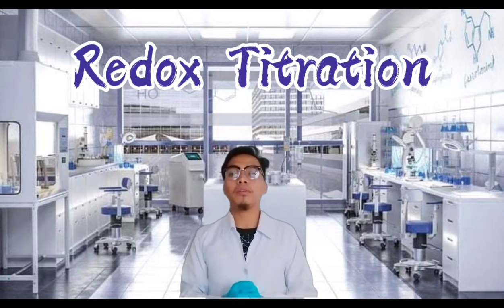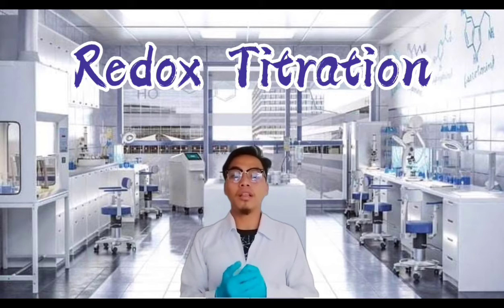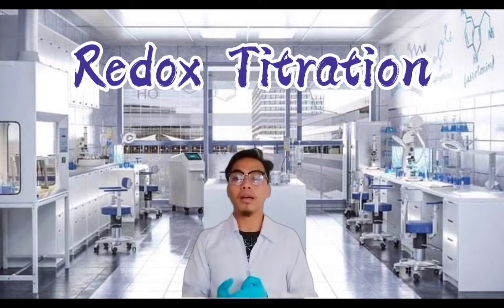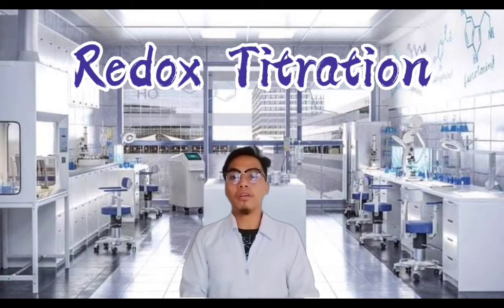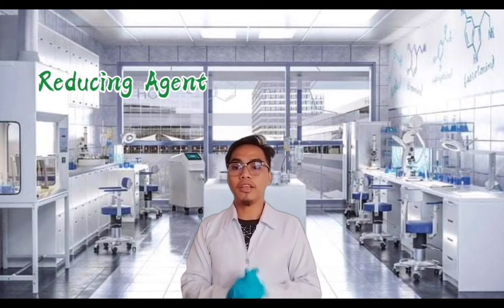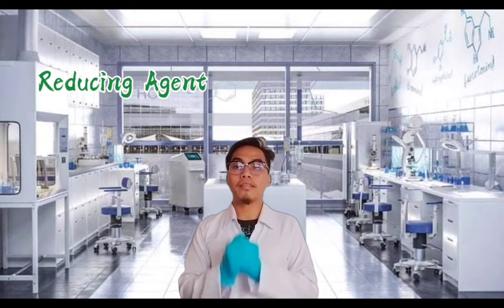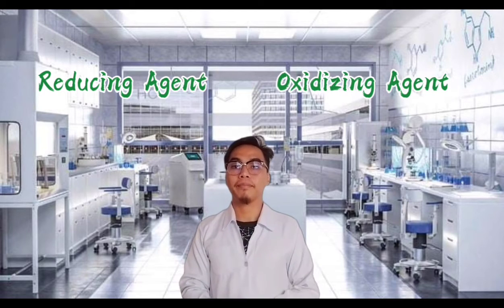In order to evaluate redox titration, the shape of the corresponding titration curve must be obtained. In this type of titration, it proves convenient to monitor the reaction potential instead of monitoring the concentration of reacting species. As discussed earlier, a redox reaction involves both oxidation and reduction. The substance that donates electrons in a redox reaction is what we call the reducing agent, while the substance that takes electrons in a redox reaction is what we call the oxidizing agent.